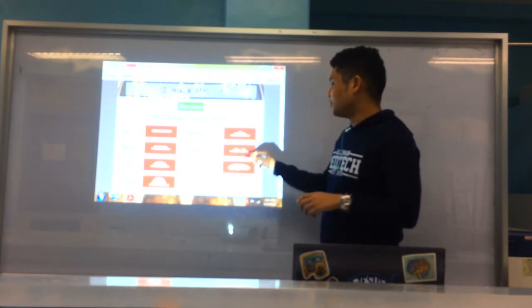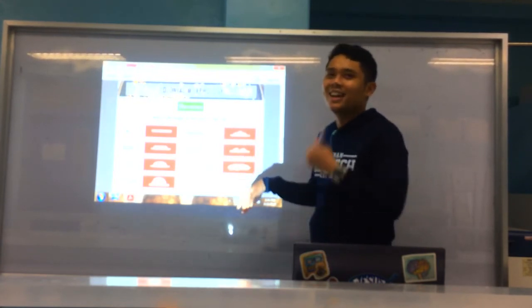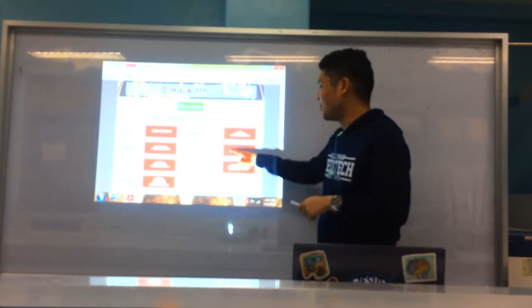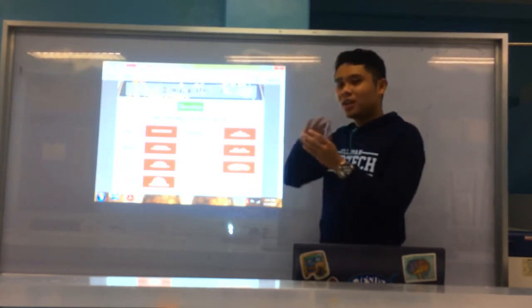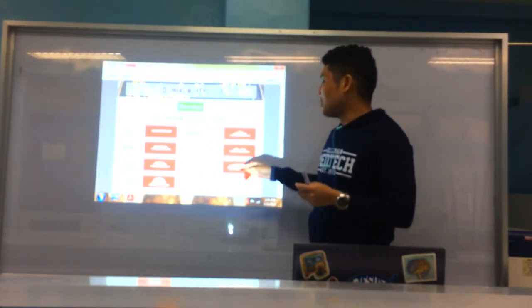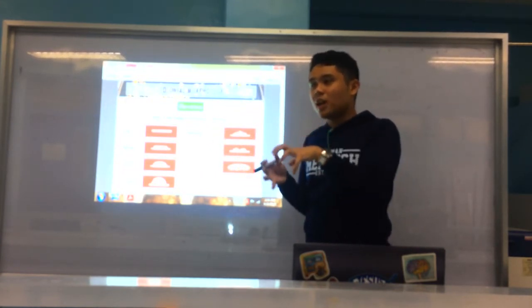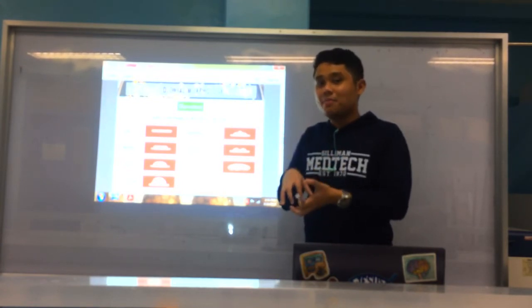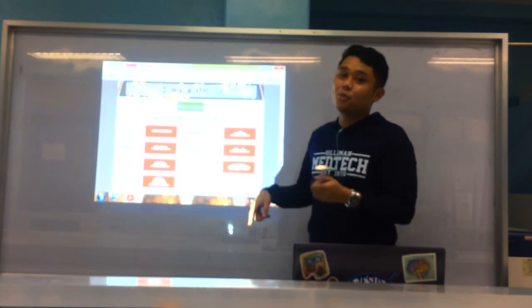Daghan siyang, mura siya bulubundukin. Yes. Elementary man ay nino, mga anyong lupa. Umbilicate. Mura siya different, na mga different elevations. And growth into the media meaning, ang culture, ang colony mismo kay ni grow na siya within the media. Usually, ma-observe niya siya sa mga fungi pa rin.